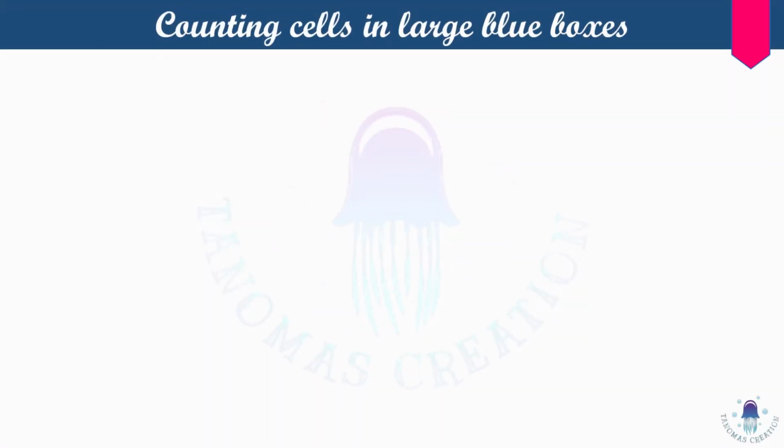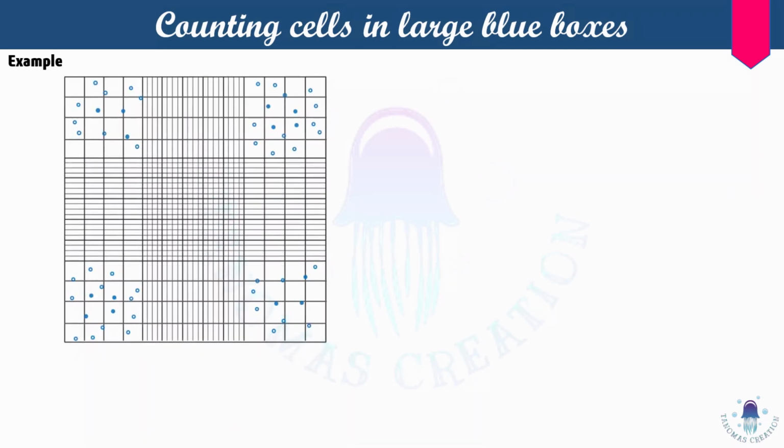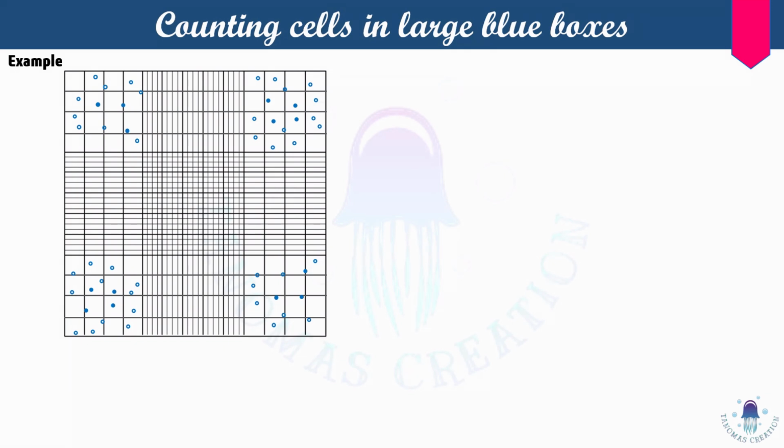Now let us come to the large blue boxes. Let us count some cells in the large blue boxes with an example. Suppose this is the hemocytometer and it has the cells in the blue boxes.